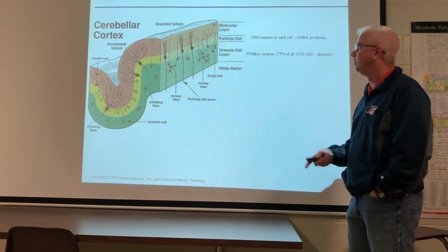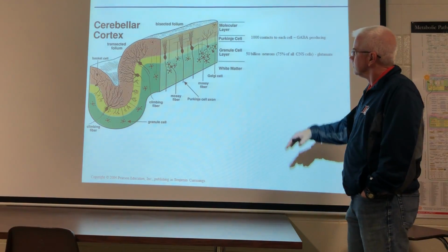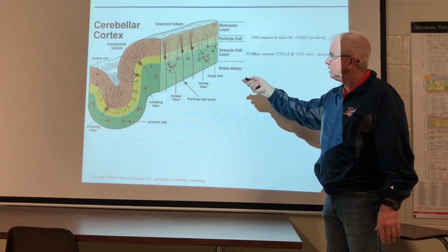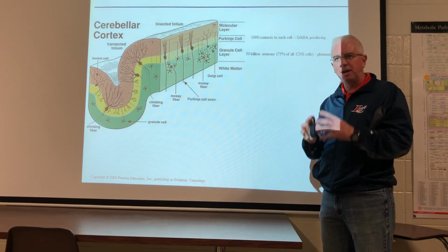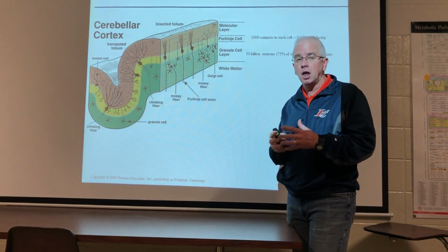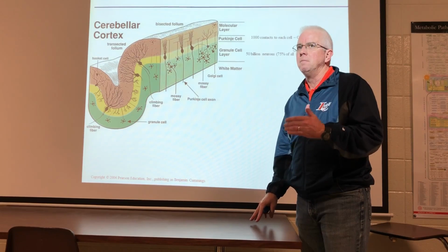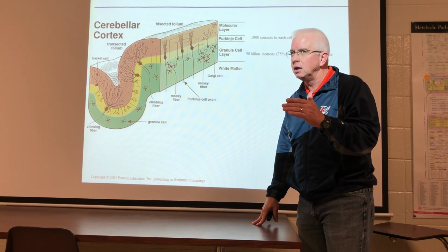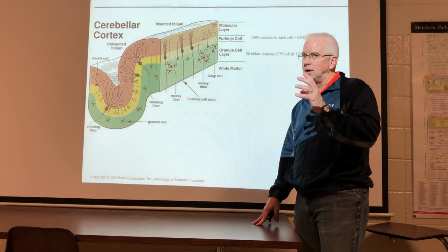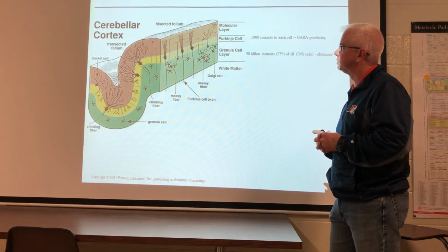Now, what I didn't tell you before, and I don't ask numbers questions like this on tests, but this is intended to say, you gotta be kidding me. The Purkinje cell layer is a layer of the cerebellum that's easily identified. And the Purkinje neurons, you can see them here, are some of the biggest neuron cell bodies in the brain. You can clearly see them, and a lot is known about them. The Purkinje neurons appear to be major inhibiting connectors because they make loads of this neurotransmitter called GABA. They're inhibitory neurons, and they're really easy. They're beautiful in histosections. You can see them.